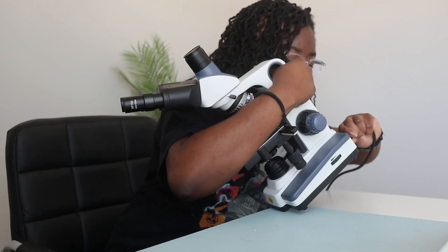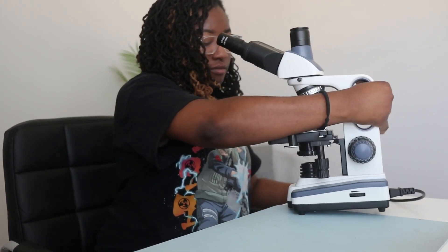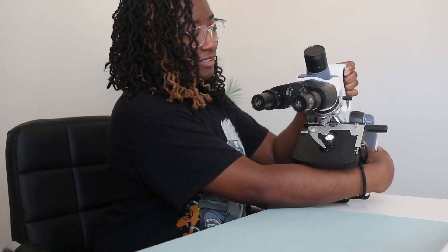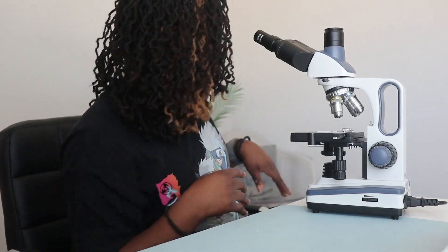Let's power this bad boy up. It works! My light came on. You can see. Let me grab the rest of my accessories because I did buy some other stuff on Amazon too.